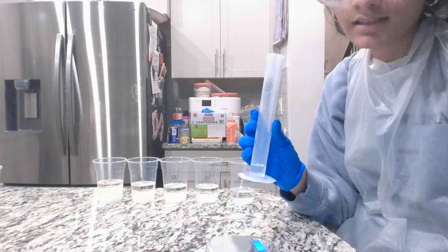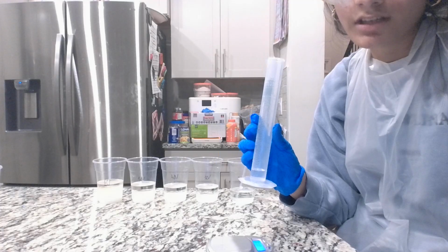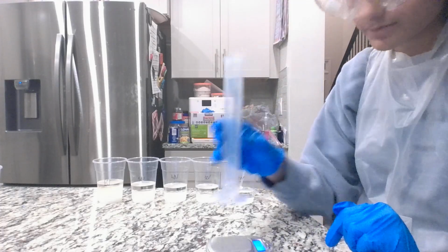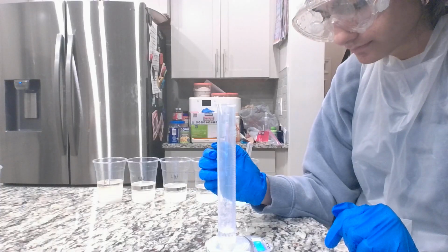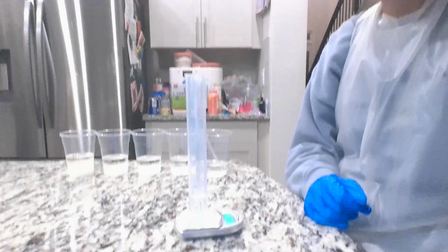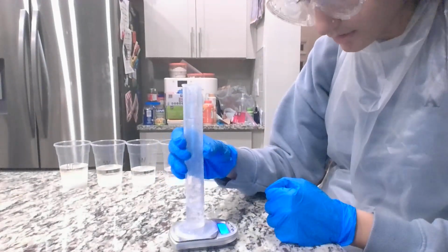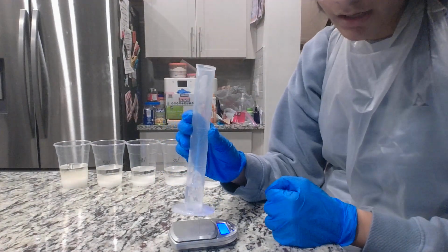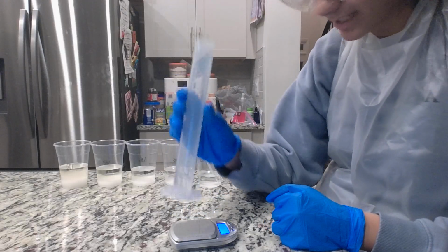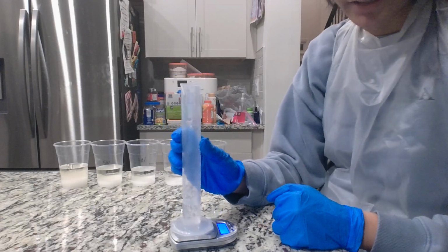Now, this is 20% of sucrose in solution, and this is 5 milliliters. This is 20% of sucrose in solution again, but this time it's 10 milliliters.